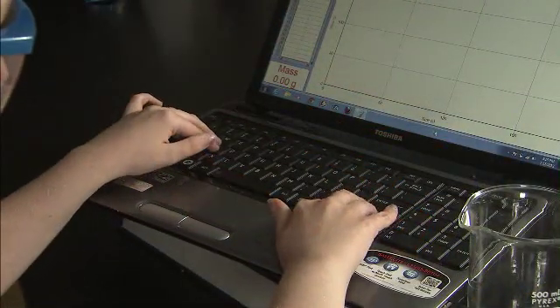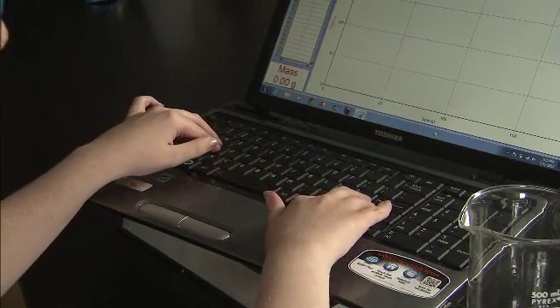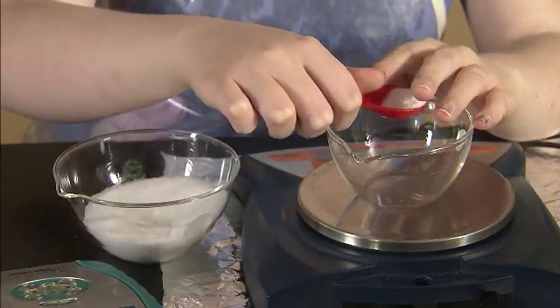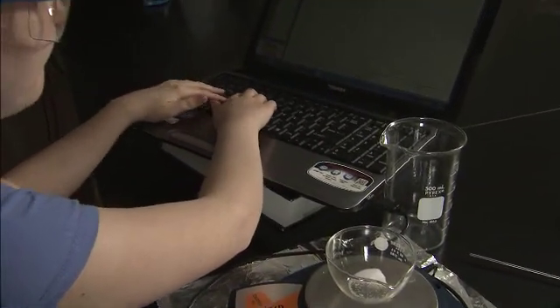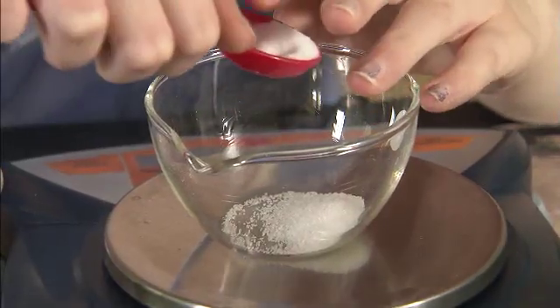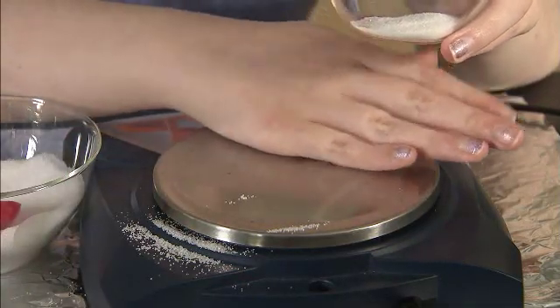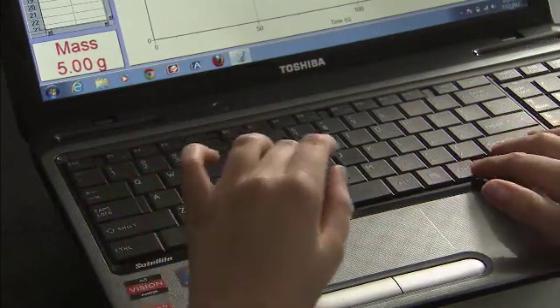She confirms the calibration with the computer by pressing Ctrl, Shift, and S to hear the current sensor measurement announced: Mass zero point zero zero zero g. Using a teaspoon, she scoops salt into the container on the balance and checks the new mass after each addition by pressing Ctrl, Shift, S. Mass one point zero six g. She repeats this procedure until the mass reaches five grams. The aluminum foil underneath the balance will alert her to any salt that was dropped. She then lifts the container and wipes any extra salt off the balance to confirm that she has reached the desired mass. Mass five point zero zero g.